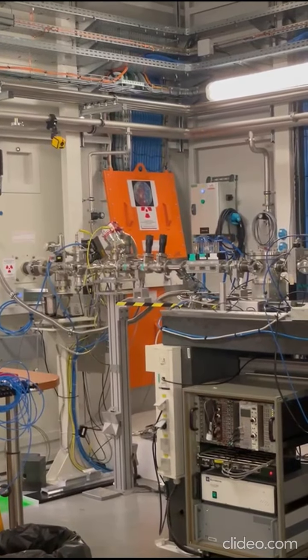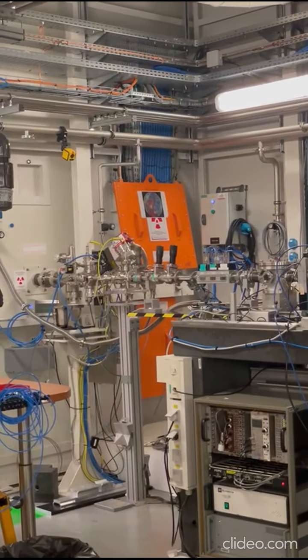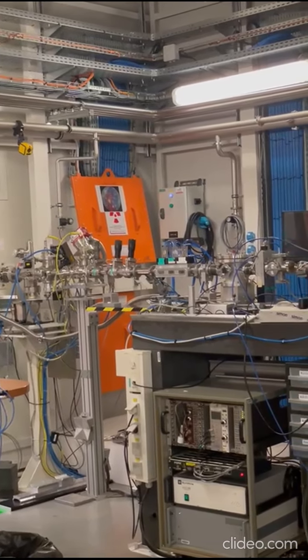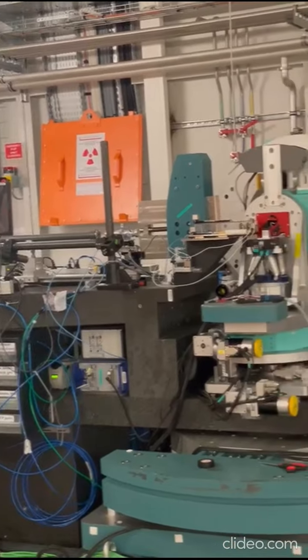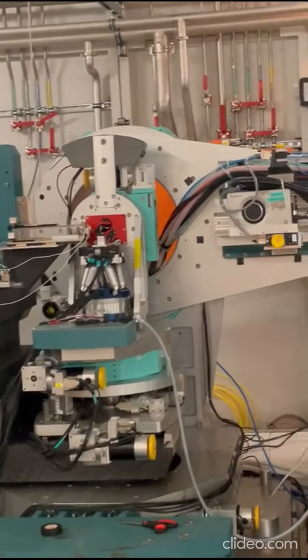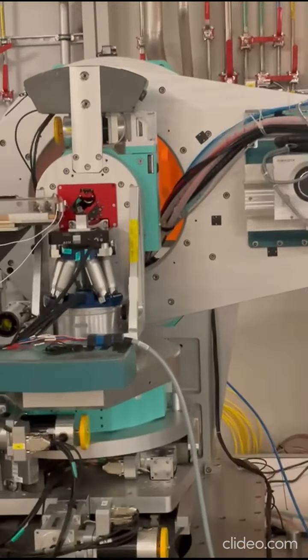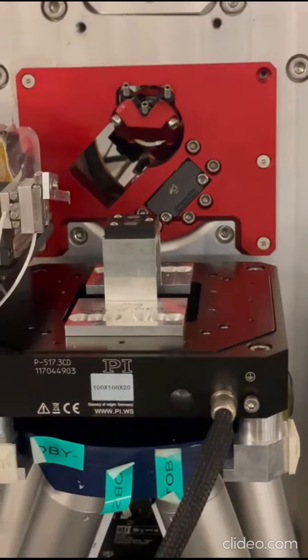This is the optic system that is used to focus the X-rays. Light of a particular wavelength is filtered out and is then made incident on the sample that is mounted on a nanopositioner. So you can see the nanopositioner here, which has hexapods. This is where the sample is mounted.